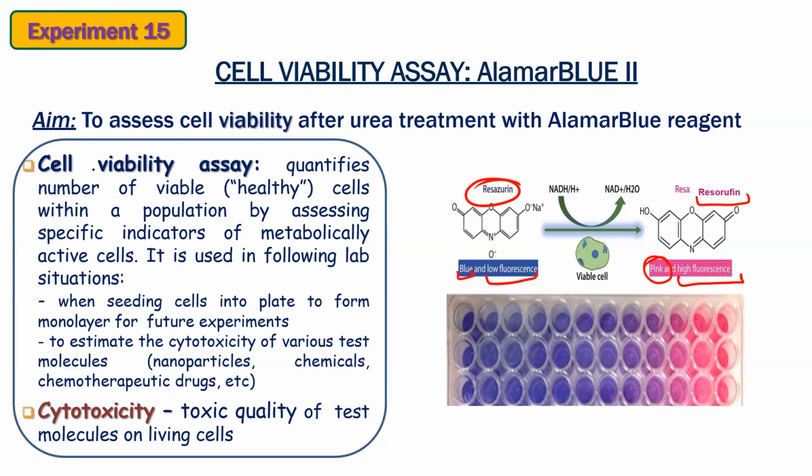Now we are going to look at the viability of the cells, because let's say again in pharma, you could start with 1,000 chemicals, and of course you cannot use them on animal models. You will need to have some kind of fast track to see if some of them are actually killing cells.